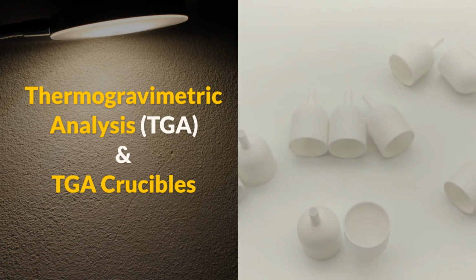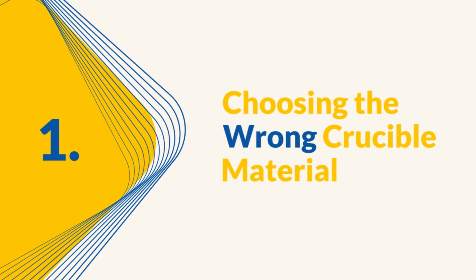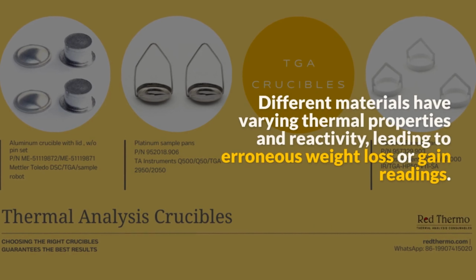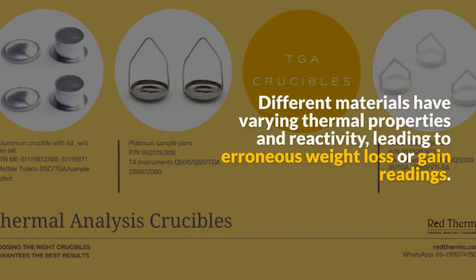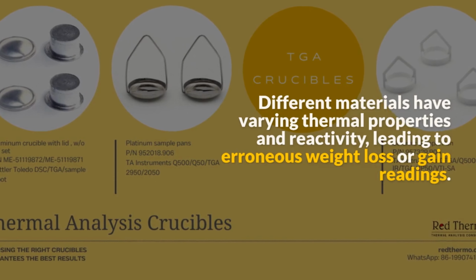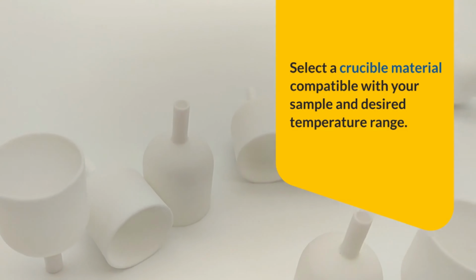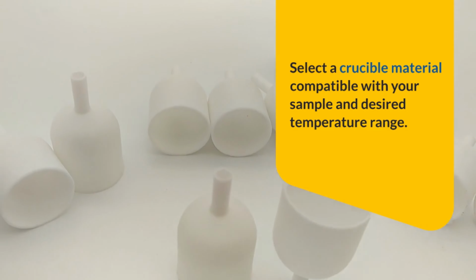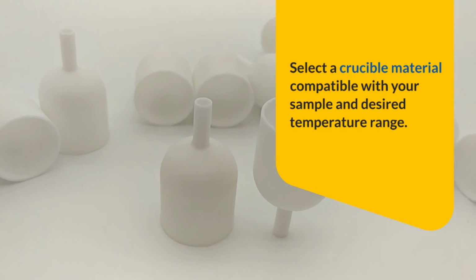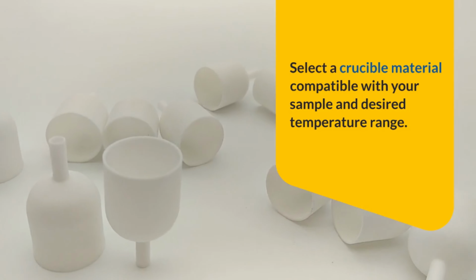during TGA crucible usage. The choice of crucible material can significantly impact the results of your TGA analysis. Different materials have varying thermal properties and reactivity, which can lead to erroneous weight loss or gain readings. It's vital to select a crucible material that is compatible with your sample and the desired temperature range of your analysis. Common crucible materials include aluminum oxide, platinum, and ceramic materials, each with their own advantages and limitations.